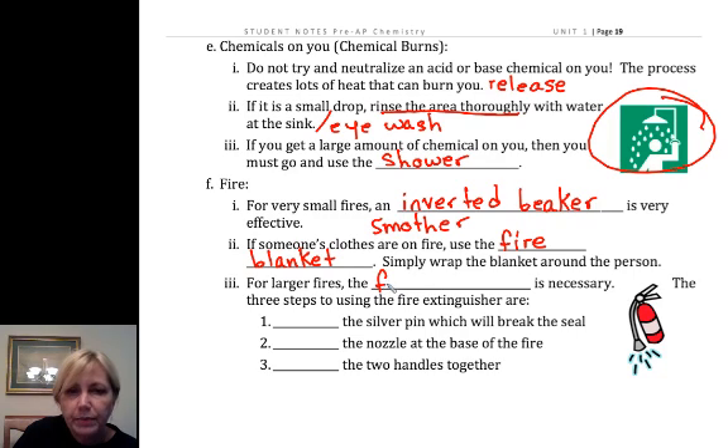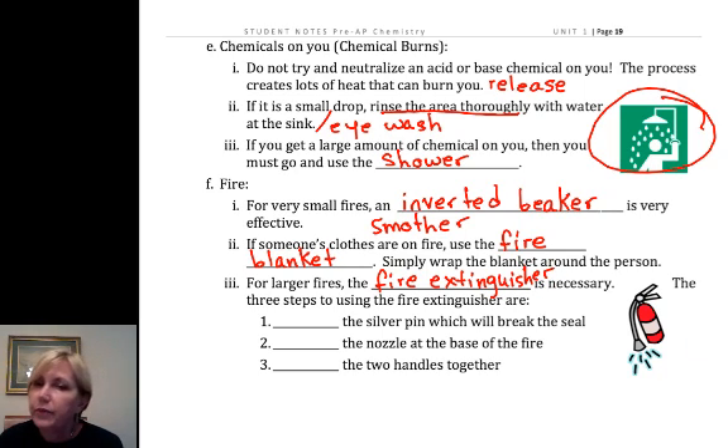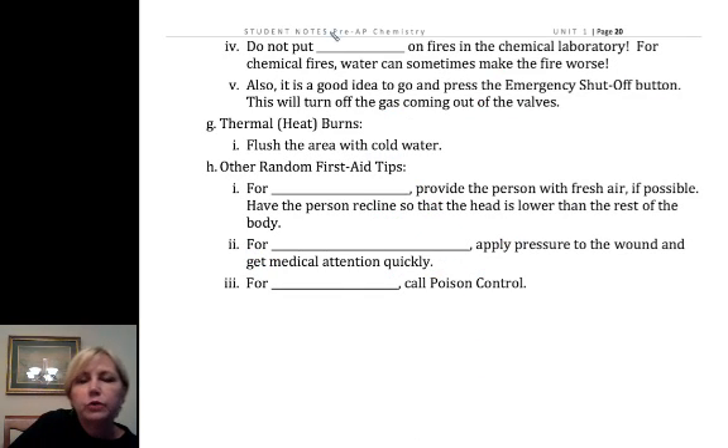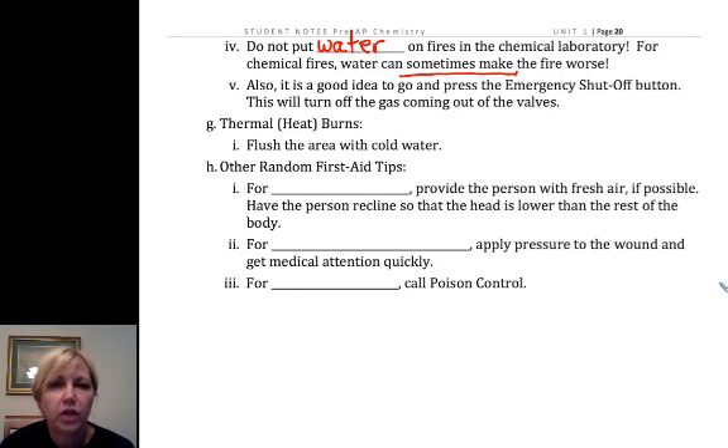For larger fires, we may need the fire extinguisher. I've never had to use one, so fortunately we've been very careful. If we keep our lab safe, we don't have to worry about these emergencies. But if needed, pull the silver pin, then point the nozzle, then press — so pull, point, press. We do not want to use water, because there are times when water actually feeds the chemical reaction.